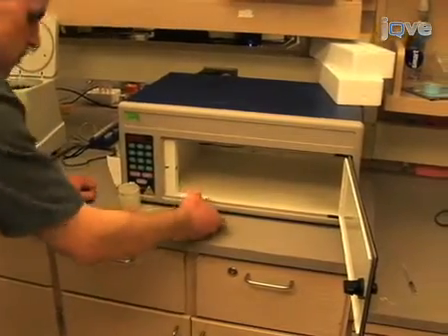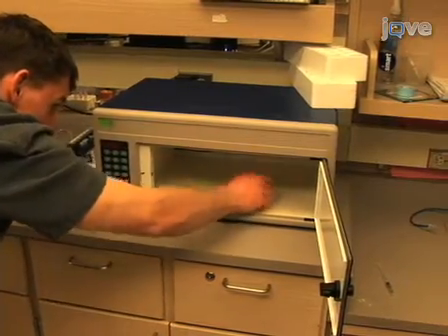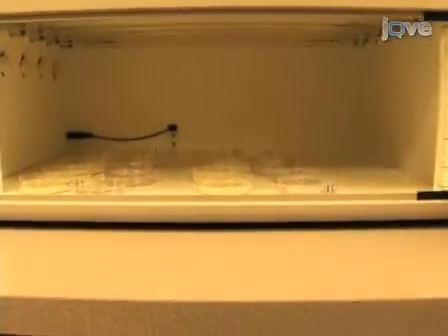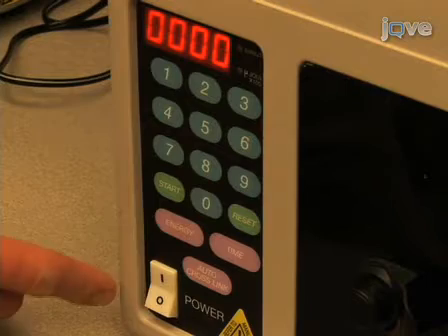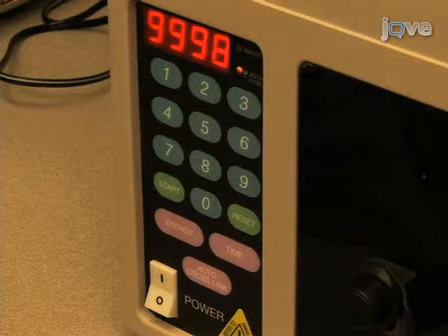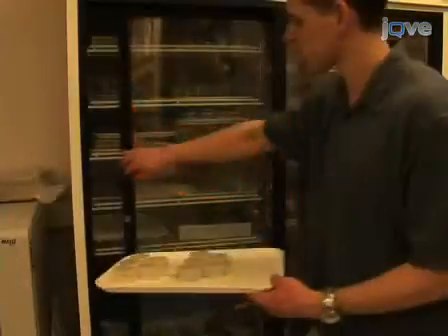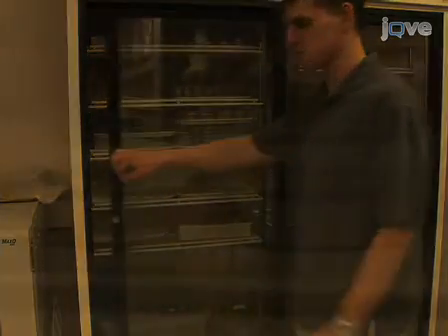Once dry, expose the surface of the plates to a UV dose strong enough to stop the bacterial growth. We use a Stratagene UV Stratolinker 2400. Begin by loading the plates in the Stratolinker without their lids on. Press ENERGY, enter 9999 on the keypad, and press START. The plates will be exposed to UV for approximately 5 minutes. Plates with UV-killed bacteria can be stored upside down, at 4 degrees Celsius, for up to a month.